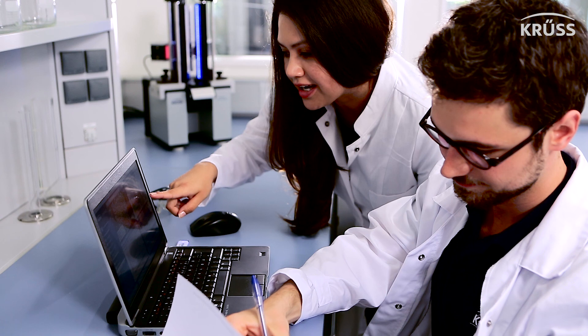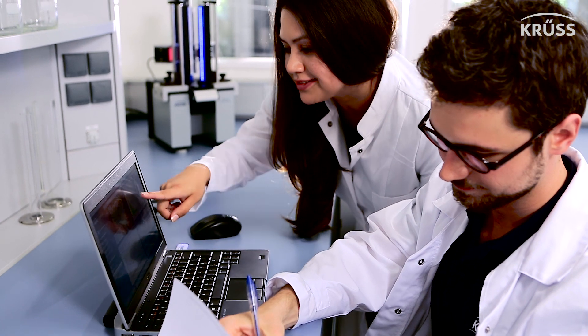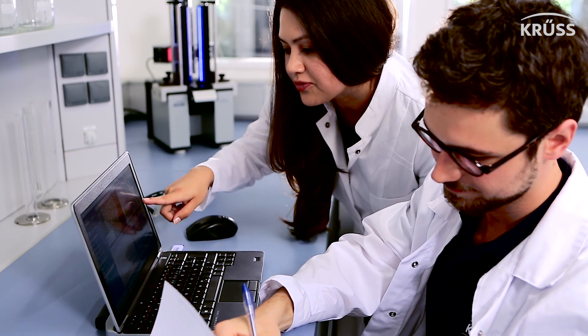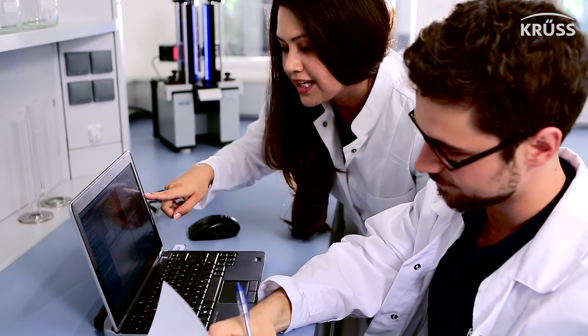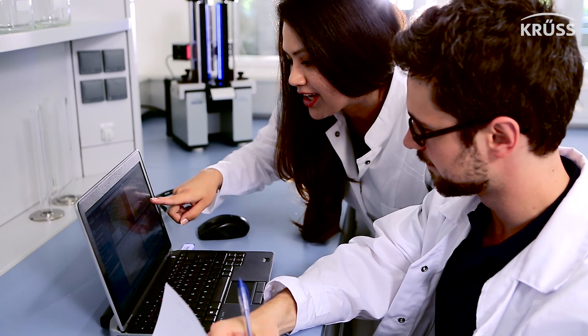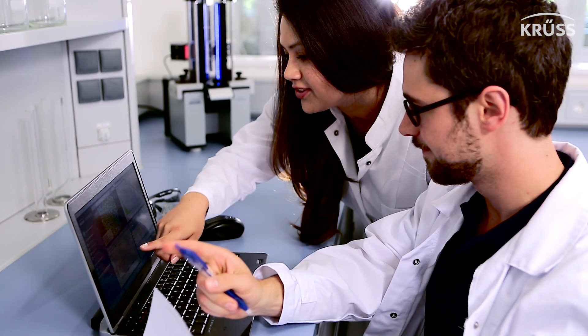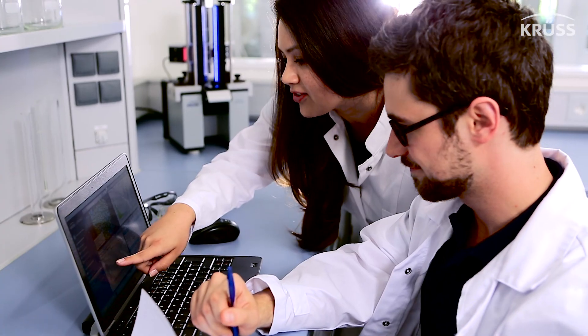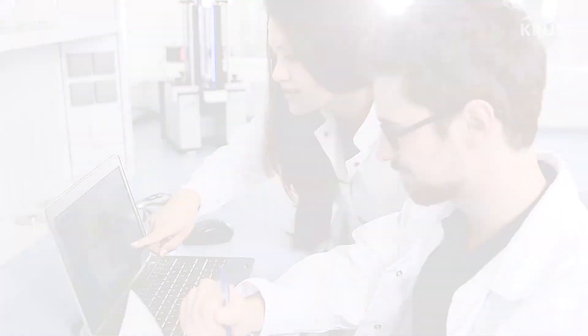We are excited to see how you will use the powerful scientific analysis tools of our ADVANCE software to improve the quality of your foam.